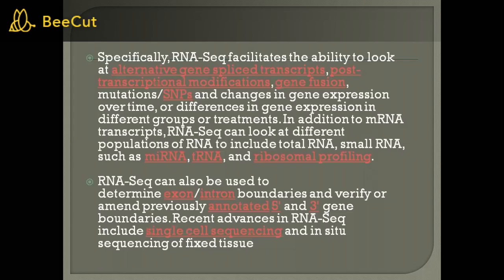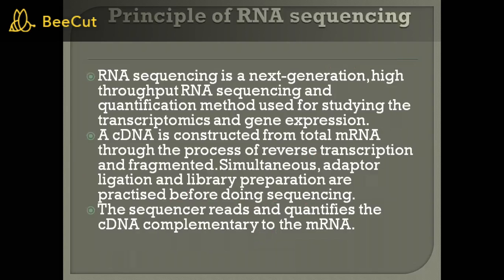And recent advances in RNA-seq include single cell sequencing and in situ sequencing of fixed tissue. So we can do in situ sequencing of a fixed tissue, or we can also do single cell sequencing. So these are the advances in the RNA-seq technique.